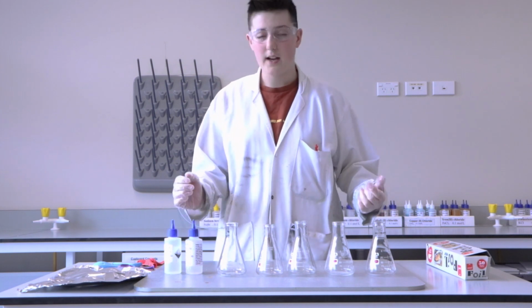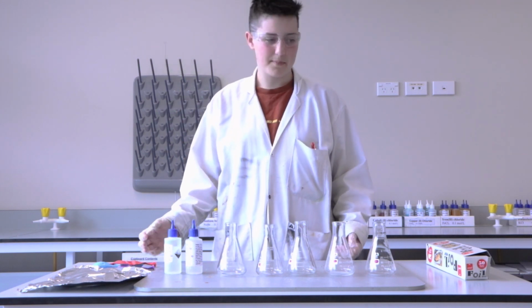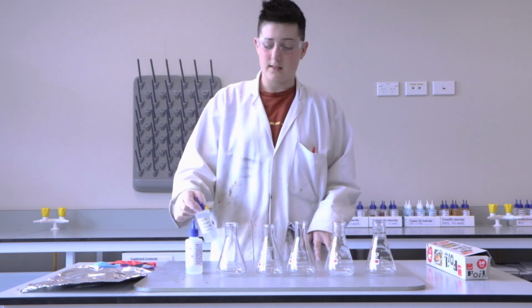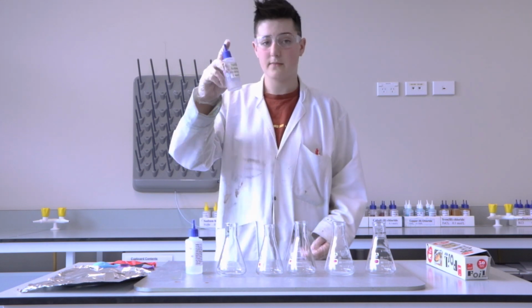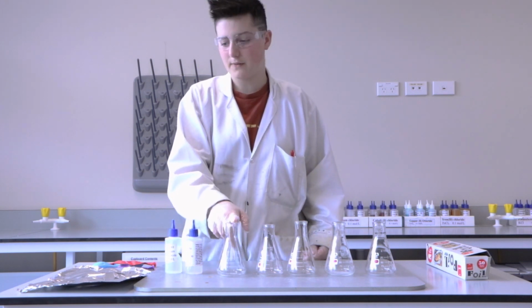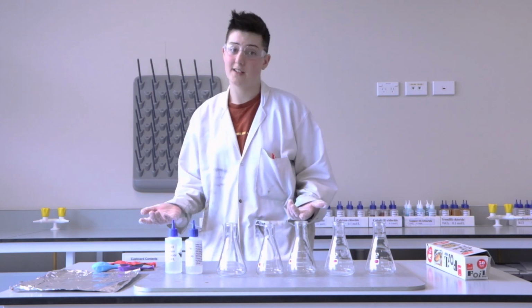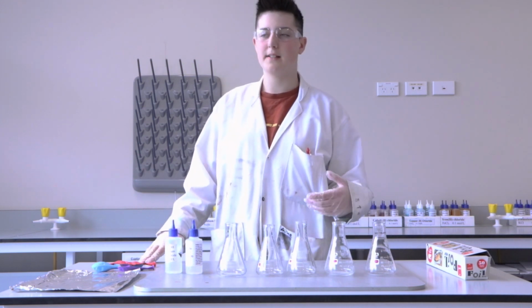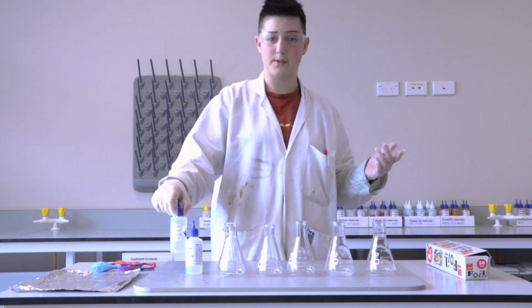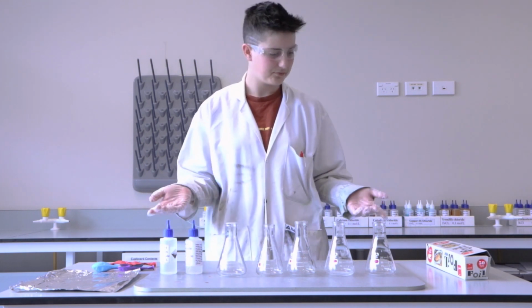This experiment is called the hydrogen balloon experiment. So, I mean, obviously, I have balloons, right? But I don't have any hydrogen, so I'm gonna get the hydrogen from somewhere. So I'm using sodium hydroxide, NaOH, and I'm going to react that in this flask with aluminium foil, which will release hydrogen gas. So, obviously for this experiment, safety-wise, safety goggles, lab coat, gloves, because sodium hydroxide is corrosive, and I don't really want to get that on my hands.